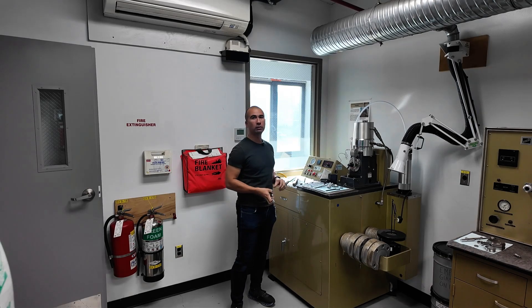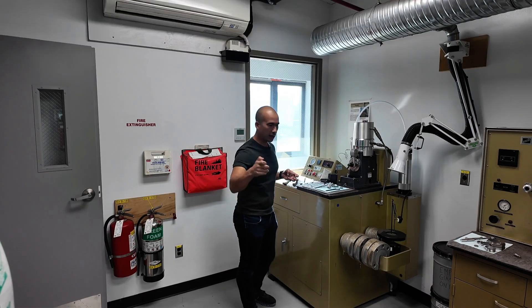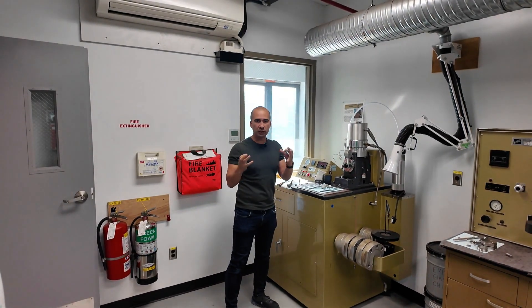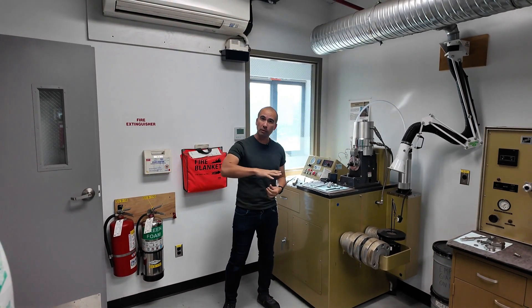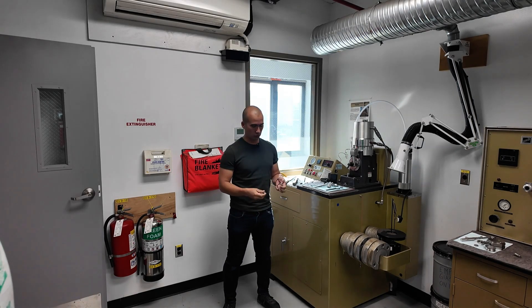Here, for example, is something called the Timken test. You might see it on a lot of spec sheets as the Timken OK load. Effectively what we've got here is a disc as well as a block, and that disc is going to rotate against the block. It is an evaluation of the amount of wear. We're doing it under specific conditions — this entire apparatus allows us to very much control the amount of load and obviously the speed — and that's going to give us the Timken OK load.